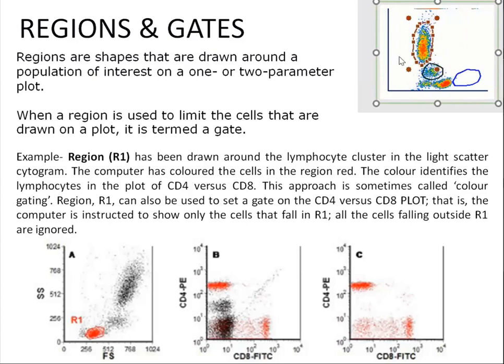So this is my first plot. I told you some universal plots, right? First, for stable acquisition, you use a time plot. Then you use forward scatter and side scatter to select the viable cells. Then you use a singlet plot. Then you use a side scatter CD45 plot. These are all universal plots. If you do any analysis, these 3 or 4 plots should always be there as your first plots. Similar to this is a side scatter CD45 plot showing lymphocytes, monocytes and neutrophils.